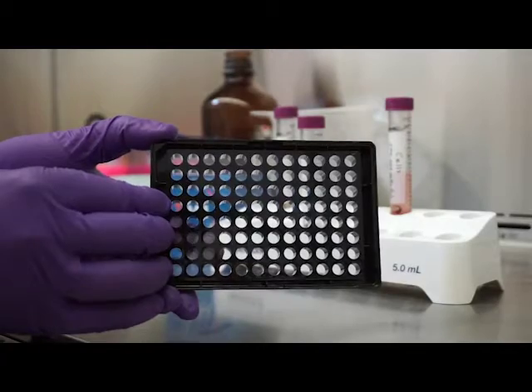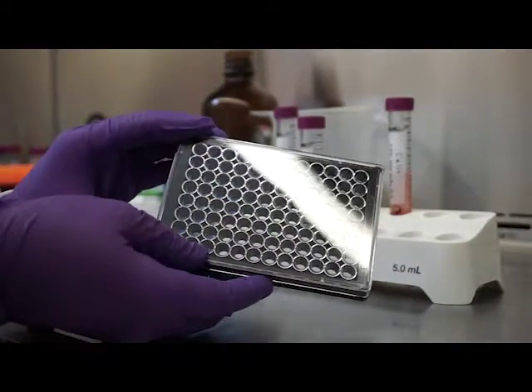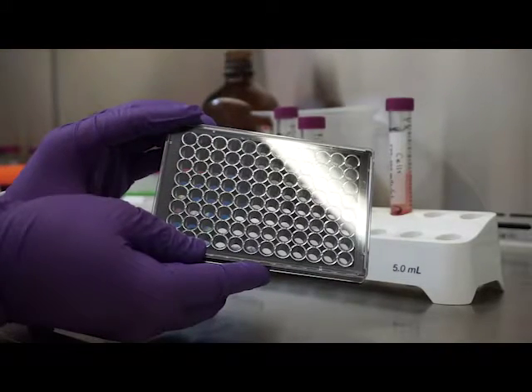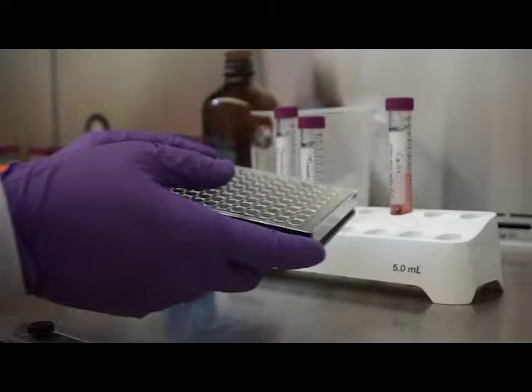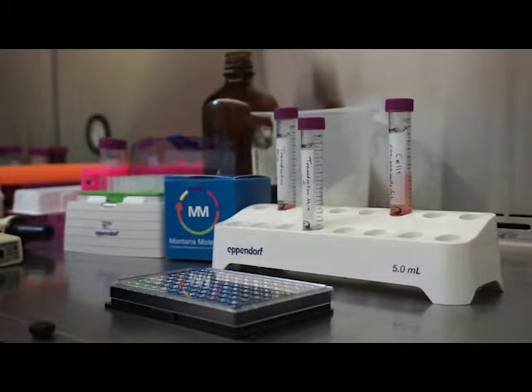In choosing a plate, you want a black clear-bottomed plate with low autofluorescence. It is also strongly recommended that the plate be coated with PDL or another cell coating agent that promotes cell adhesion. Montana Molecular's assays can also be set up in 384-well format.